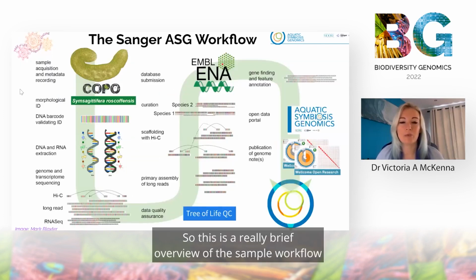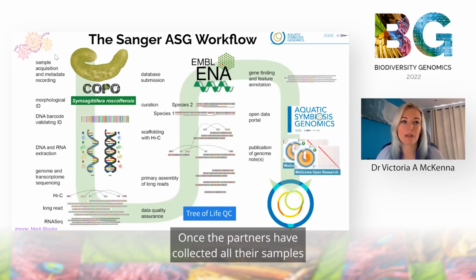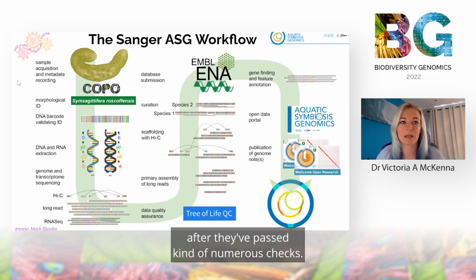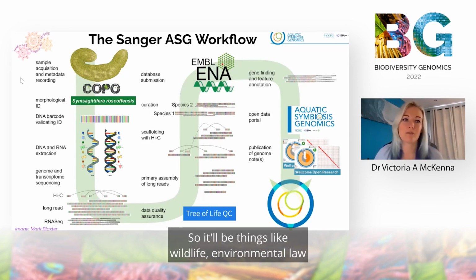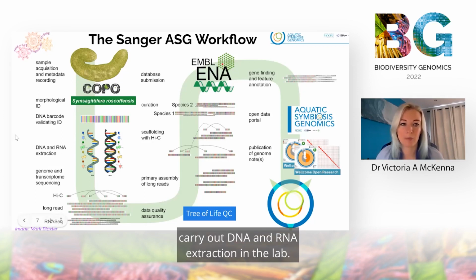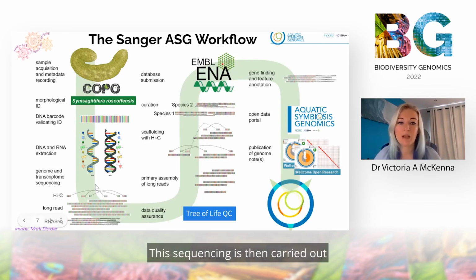This is a really brief overview of the sample workflow from ASG that I'll be talking about today. Once the partners have collected all their samples at the beginning of the project, they ship them to us after they've passed numerous checks, such as wildlife, environmental law, and legal checks. We then carry out DNA and RNA extraction in the lab. Once the DNA and RNA extraction have passed QC, they're passed on to our scientific operations teams for sequencing. The sequencing is carried out, passes the data quality assurance, and is assembled and scaffolded. This is assessed against our Tree of Life quality control.